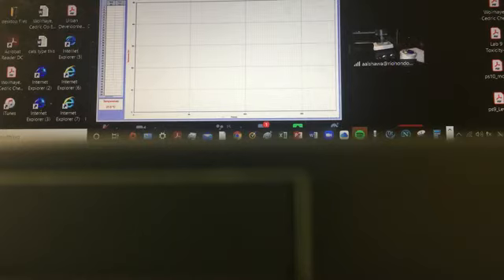Alright, so how is the temperature going on this side? So it's still in the 50s. So I have another thermometer. This one is a little bit limited because it has that little bit fatty end, and it does not allow it to go nicely inside the test tube. I can use another thermometer.